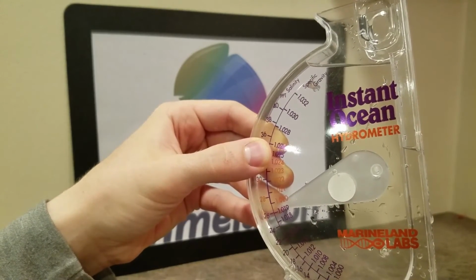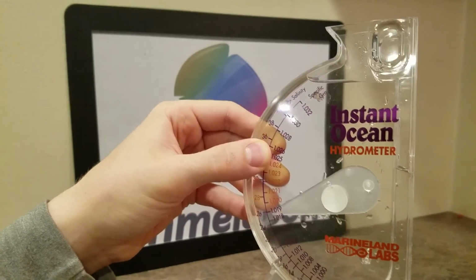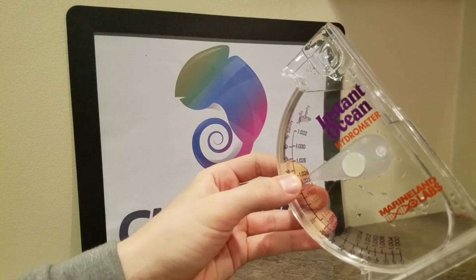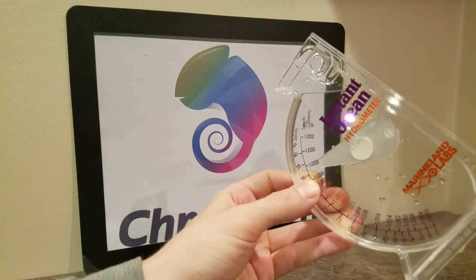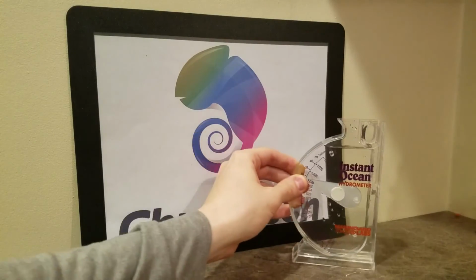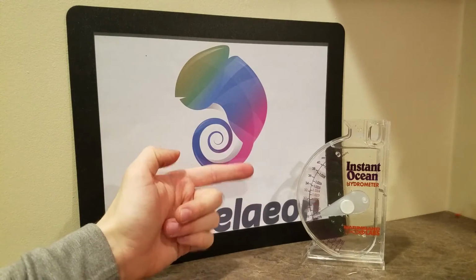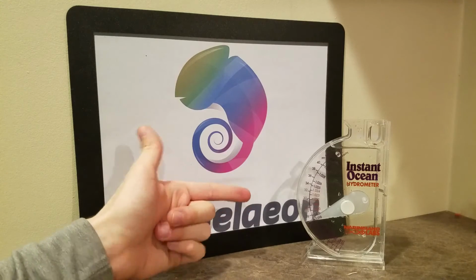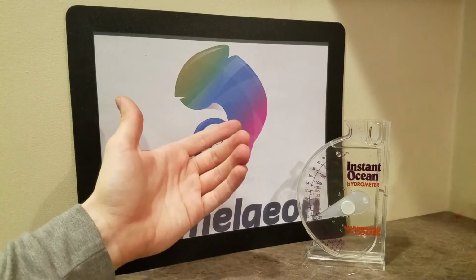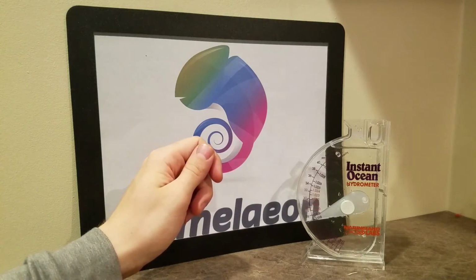The problem is more pronounced when testing pure water. Look at the gauge and see if there's air bubbles sticking to it. That will give you higher than usual results. So I would assume you can probably get those air bubbles off somehow. Let's see if that'll work. Or you can just pour it slowly. Whatever. I'm sure there's a way to do it. But it's still showing that it's fresh filtered water and not salt water. So obviously it works even with the air bubbles, even though someone's saying that it doesn't, because obviously it's not salt water.